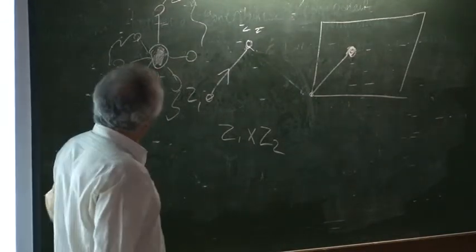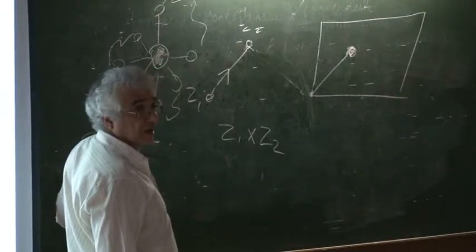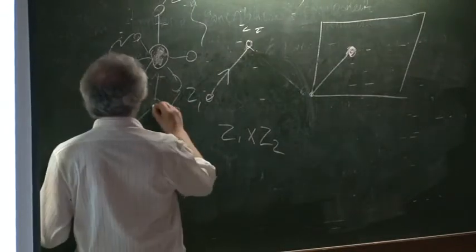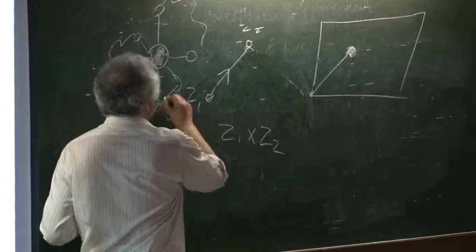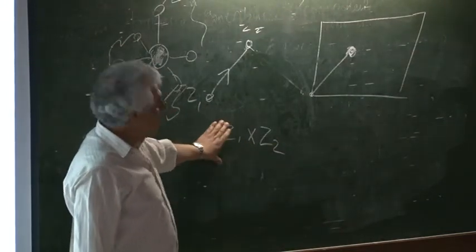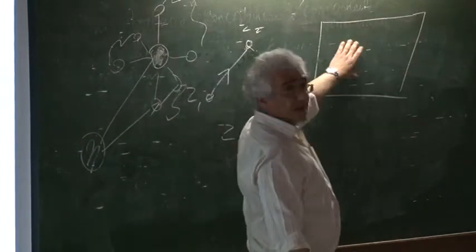So the product of these two electron densities is going to be much bigger than, let's say, this vector or this vector. So the map is going to be dominated by vectors between the heavy atoms. They will appear as the maximum.